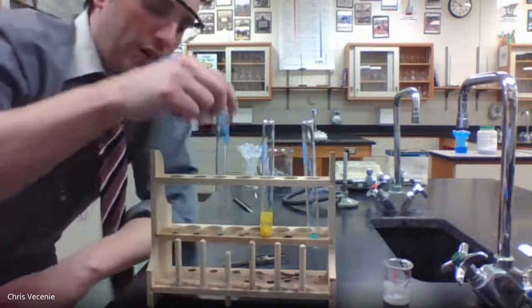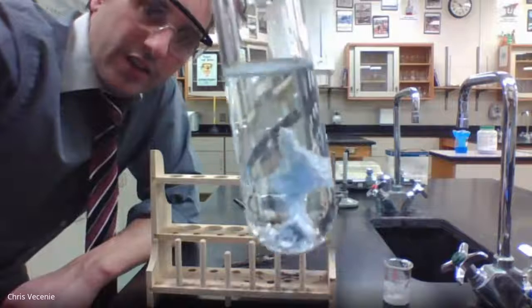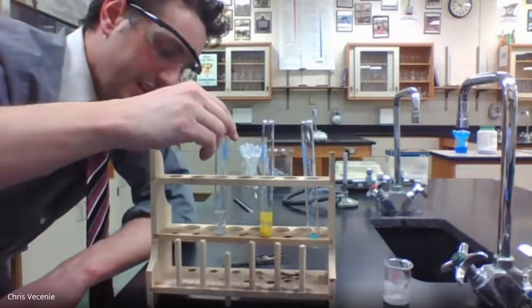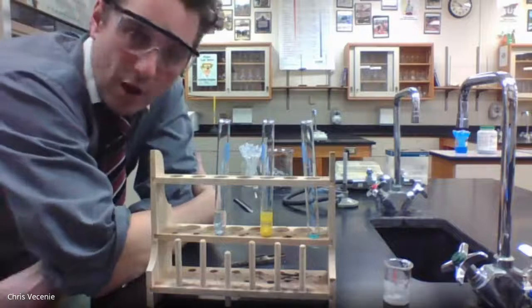And then one more look at reaction 5. You take a look there. You can see tons and tons of bubbles sitting right on that piece of metal. So you have all the tools you need to make your observations.